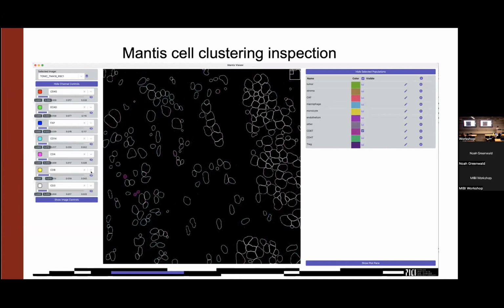We can look at some other markers, CD14, go back to CD8 just to make sure that this all works. And you can imagine the specific things that you want to toggle on and off are going to be different depending on what you're worried about the misassignment being. But in general, it's really easy to do all this. You can look at the neighboring cells, say, okay, what are they? The assignment, these are monocytes, makes sense. They were CD14 positive. This process is flexible because whatever the specific question is, it's not like they've hard-coded in CD4 T cells.